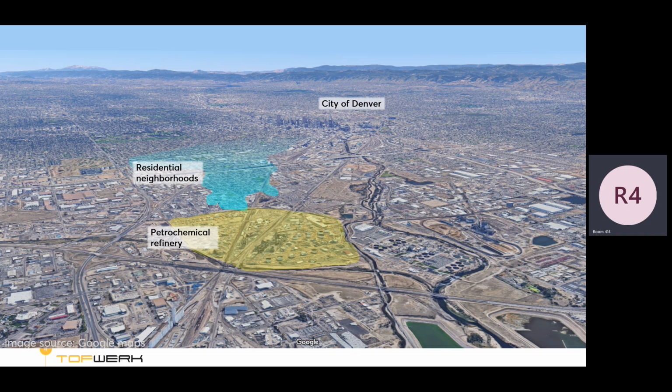So ethylene oxide is tricky mass spectrometry because it's exactly the same chemical formula as acetaldehyde. So we can detect ethylene oxide at pretty low detection limits, but it's very hard to say in ambient air if what you're detecting is acetaldehyde or ethylene oxide without any kind of extra context.